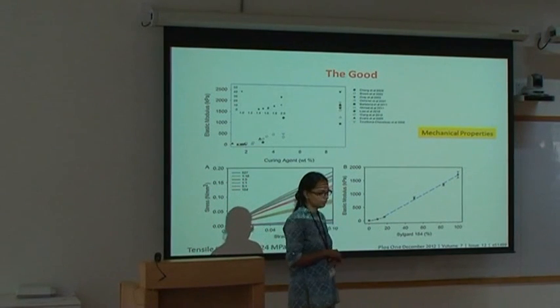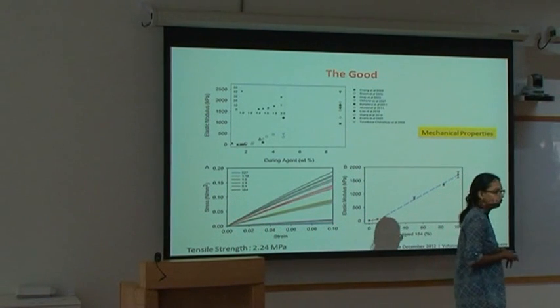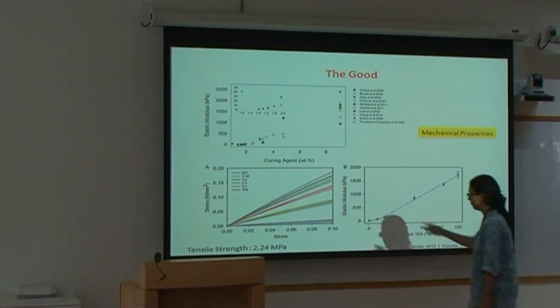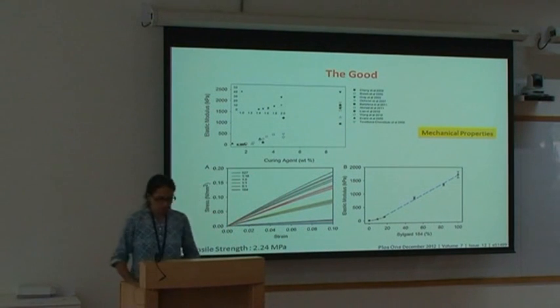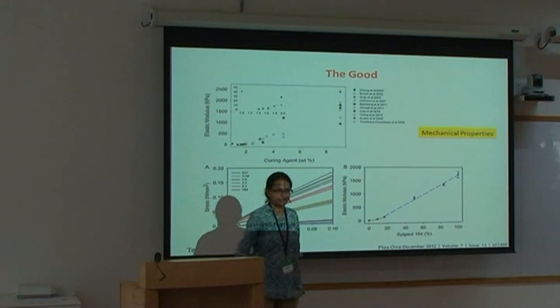What you have to remember is that you cannot really use the numbers you are using to strain it. You cannot say, I applied a 10% strain, so my cells are under 10% strain. It can be non-uniform even over the PDMS that you are using once you cross this 10% limit. So while it is good, it has its caveats, and these are the caveats that you have to take care of.